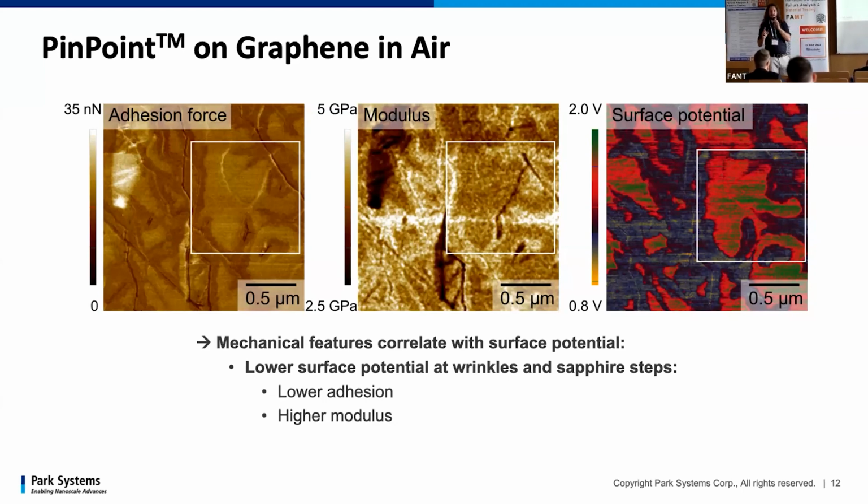So these are 2 separate measurements with 2 separate sources of noise and quality, I would say. From the scientific standpoint, it's no wonder that we see different mechanical features and surface potential features on these grains, because this is how graphene works. From the measurement standpoint, it is nice to see that we can basically see similar effects with individual measurements.